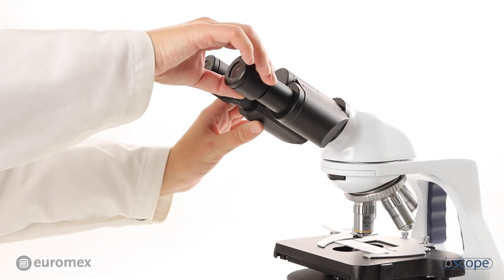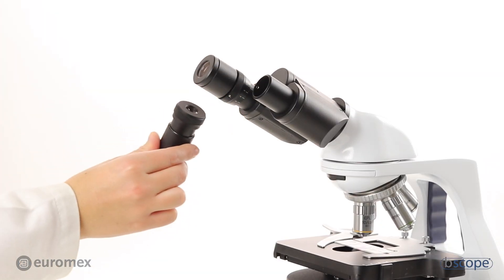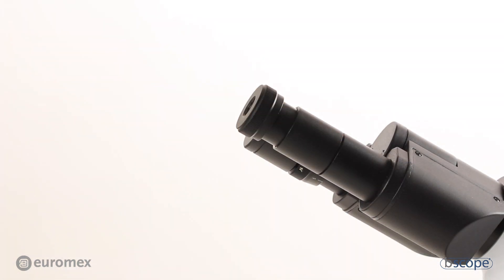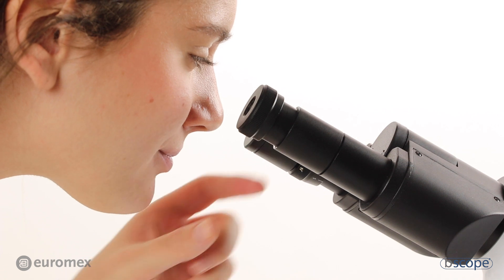Take one eyepiece out and replace it with the provided telescope. Focus the telescope on the iris of the condenser.